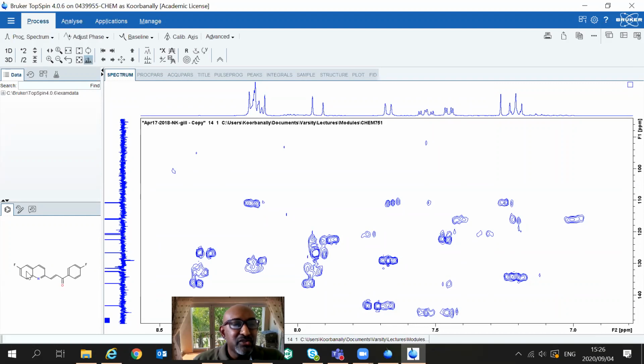When I discussed the carbon spectra, we looked at the coupling constant of this carbon. We said it was about 8 Hertz or so, which was probably this carbon atom here. And if it were that carbon atom, it would be coupled to either the proton here or the proton here, in order for me to identify it as that particular carbon. So let's see if I can identify it, because I know how that looks. That looks like a double doublet. I know this is in the big mess where all the peaks overlap. I don't know whether this is where the peaks overlap or whether this is that nice doublet that we're seeing. So we're seeing the nice doublet there, but I don't know whether that's the doublet that we're seeing.